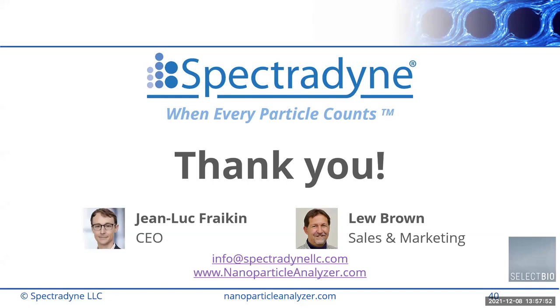Muhammad Obaid from Jordan. I just want to elaborate about the results of the nano assembler or the benchtop. We know that when the PDI values are less than 0.2, the particles would be monodispersed. But here you showed that even with PDI around 0.16 and 0.17, there is still a difference between the results of the DLS and the microfluidic system. Can you elaborate more about this difference, even though the PDI was quite small?